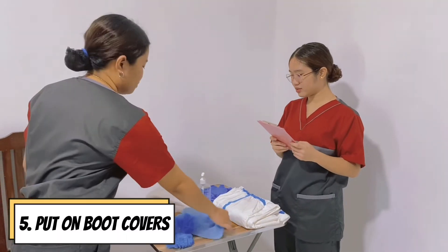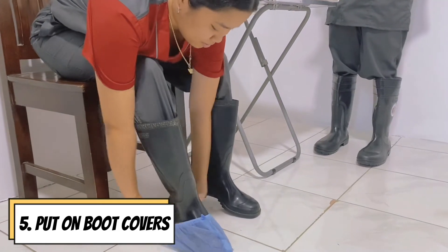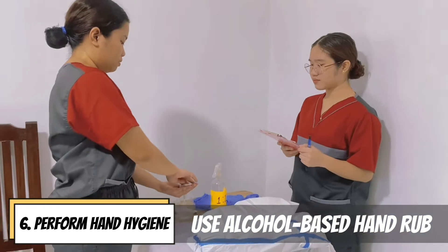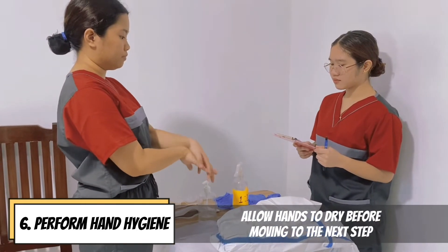Put on boot covers. Perform hand hygiene using alcohol-based hand rub and allow it to dry before moving on to the next step.